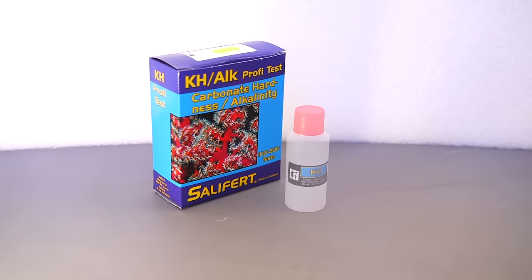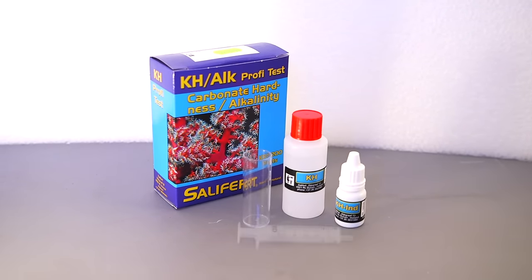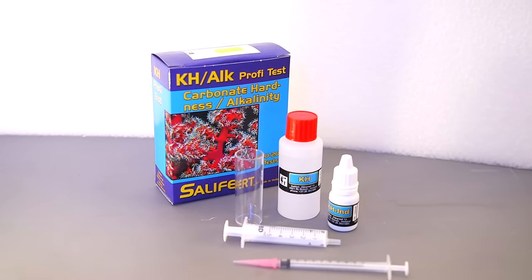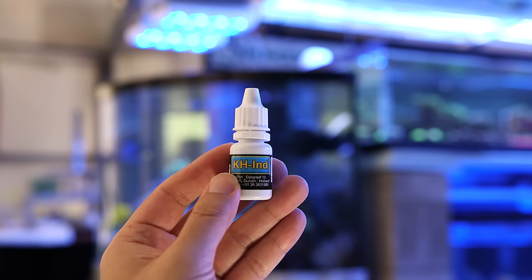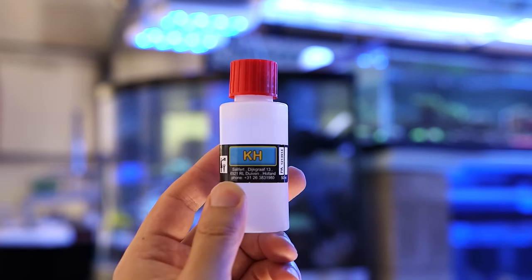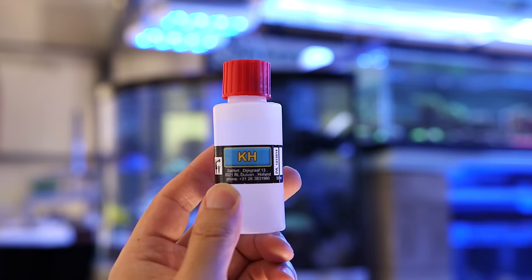This particular test kit is made by Salifert. It's a very popular brand and it's the one that I'm most familiar with. The Salifert alkalinity test is a basic titration, which is a test of buffering capacity. It's made up of two reagents. The first is a bluish stain and the second reagent is what we'll be adding drop by drop to perform the titration.